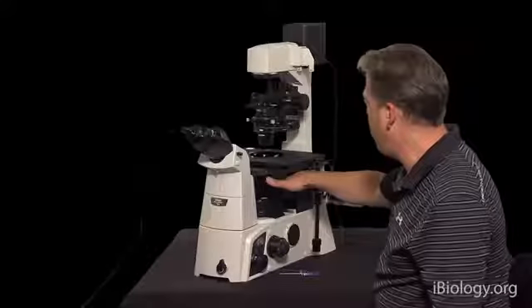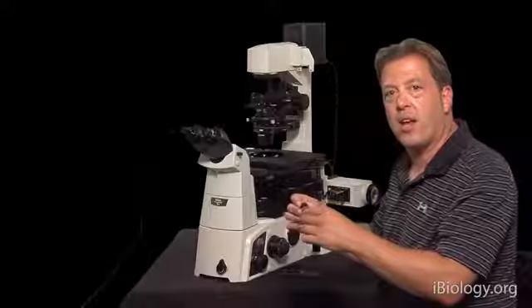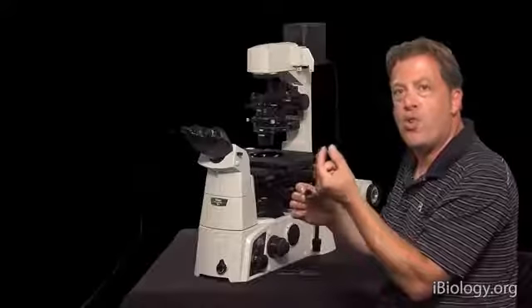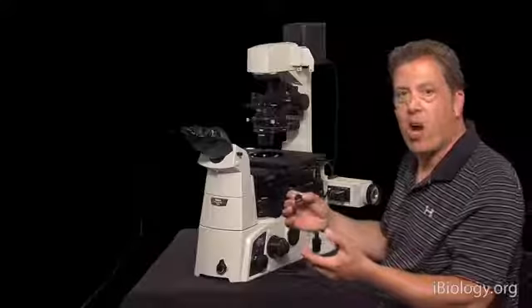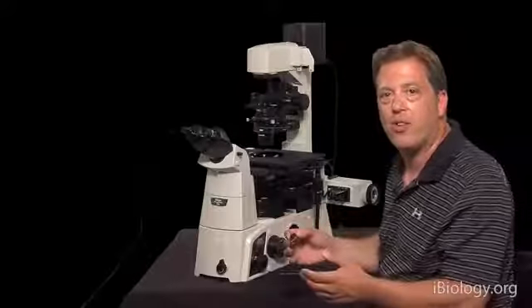Following that, you'd want to make sure you have two other components in place that are your Nomarski Prisms. This is actually a modified version of a Nomarski Prism. It's two quartz wedges that are cut at a certain shear thickness or angle that allows you to basically tailor the distance between the two rays going through your specimen such that they are either further apart, giving you more contrast, or closer together, giving you more resolution. And we make several different types of those for the microscopes depending on where you want that trade-off to be.